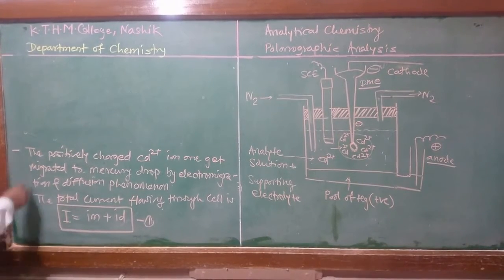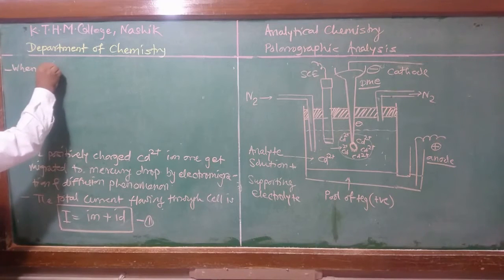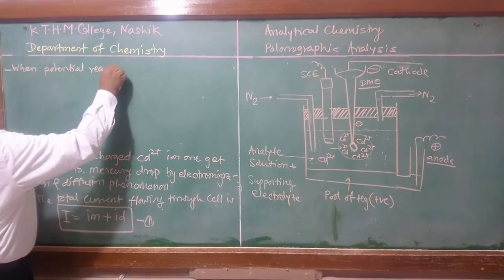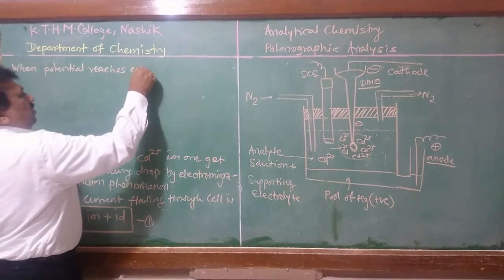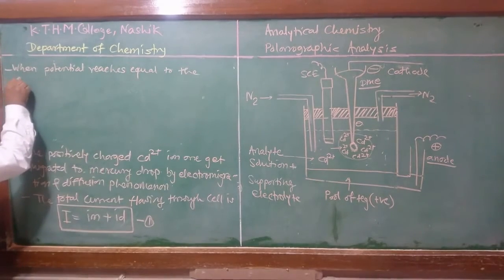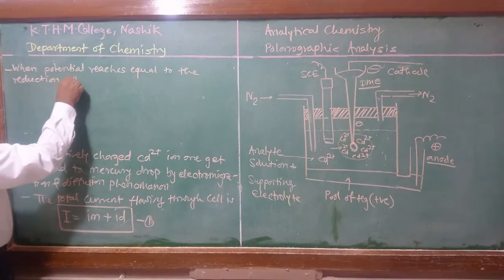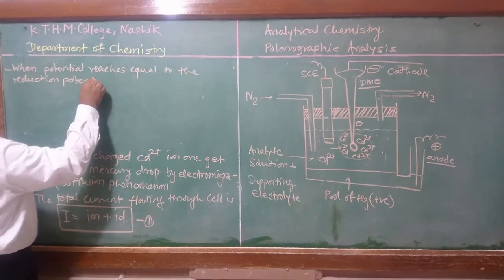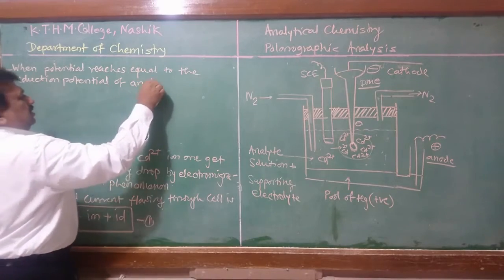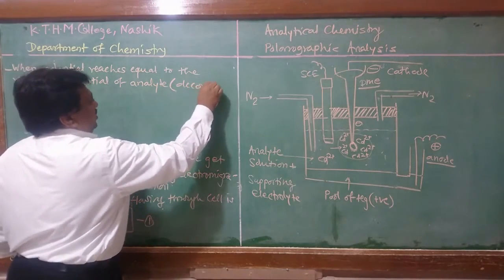Therefore in this case, when potential reaches equal to the reduction potential of analyte, this potential is called decomposition potential.